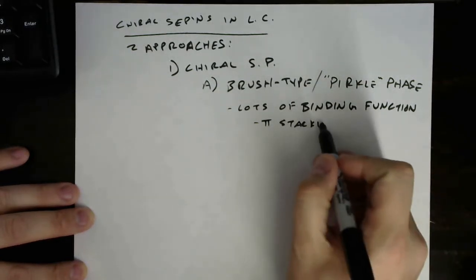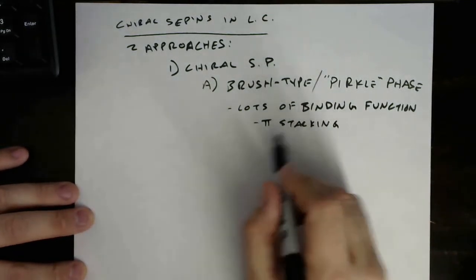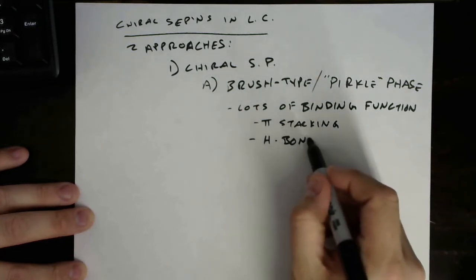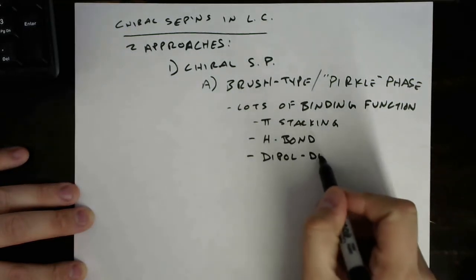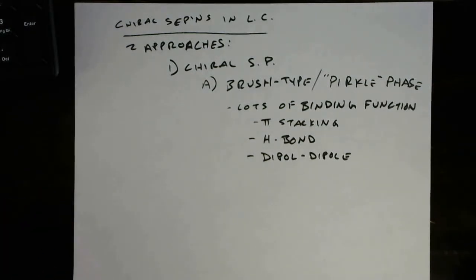So by binding, we mean non-covalent intermolecular forces, right? Things like hydrogen bonding functionalities, dipole type functionalities that are going to induce those kinds of interactions with your analyte.